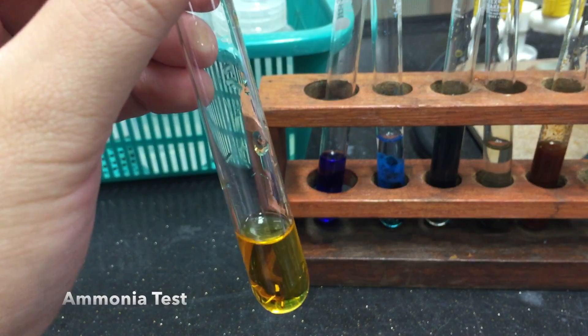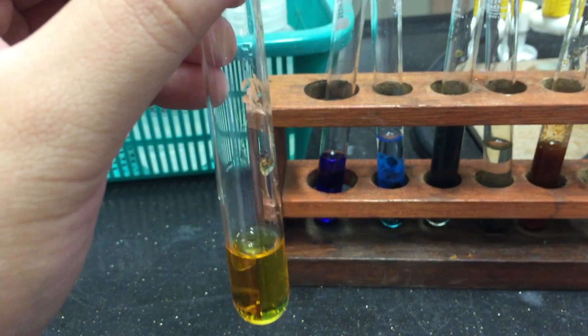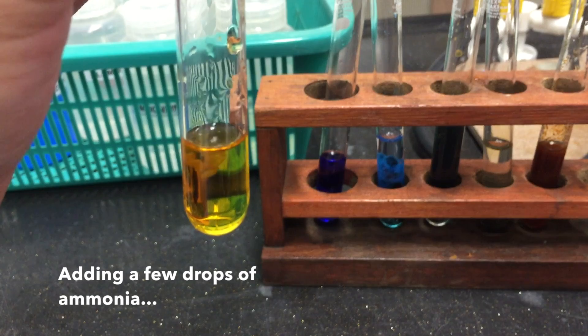Next up we have the ammonia test. To a small sample of your solution, add a few drops of ammonia solution.